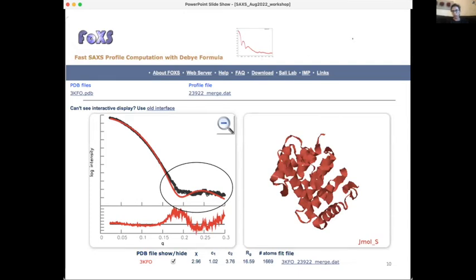So I am going to change what I share now. Remember that a SAXS profile is basically your distance distribution. And if you have missing residues, then you are missing parts of the distance distribution, but you are missing much more. So if you have 5% missing, you are going to miss around 10% from the distance distribution, which is a lot. So if you have a short protein with, let's say, a few missing residues that can be a HIS-tag, you can get quite significant misfit.